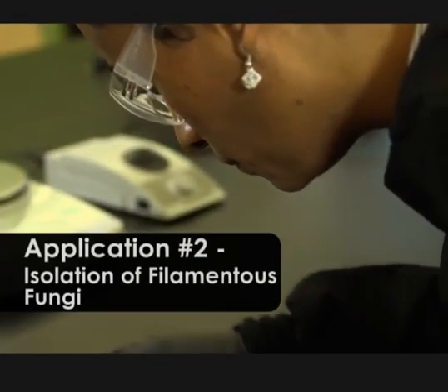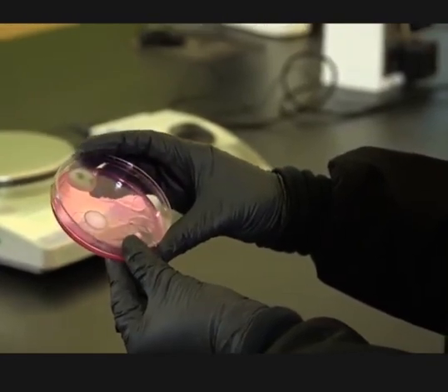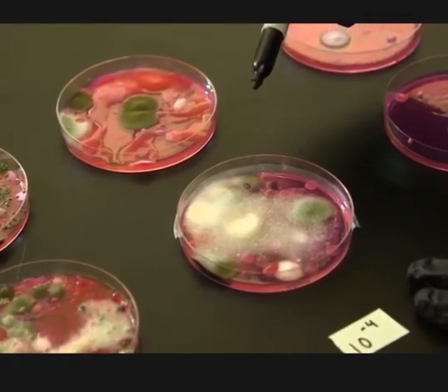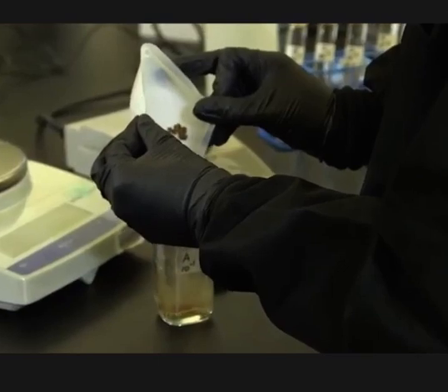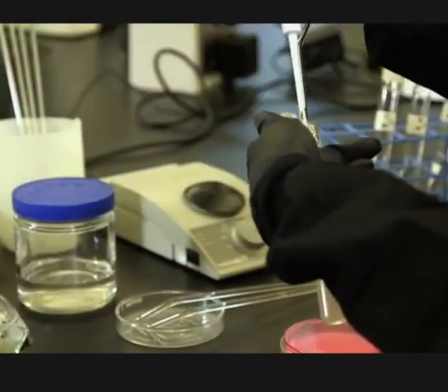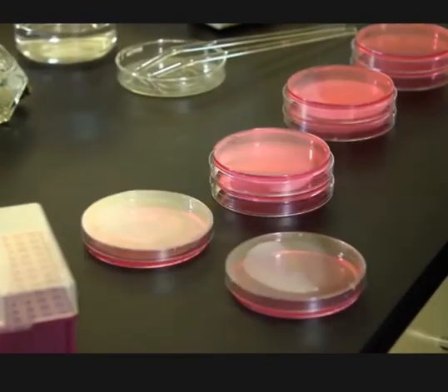Filamentous fungi are vital to soil health due to their role in nutrient recycling. The isolation and observation of filamentous fungi from soil was conducted in this example. Soil samples were diluted with water and added to separate sterile rose Bengal streptomycin agar plates. The streptomycin prevented bacterial growth and enabled fungal growth.